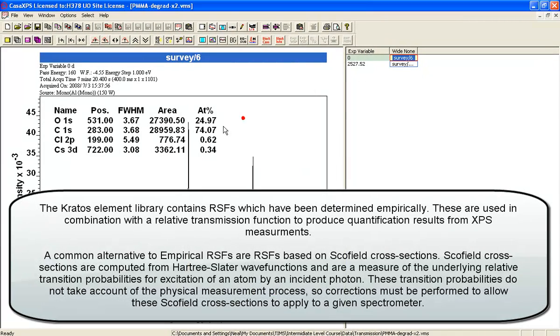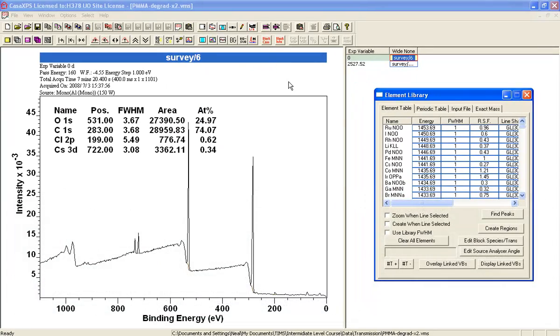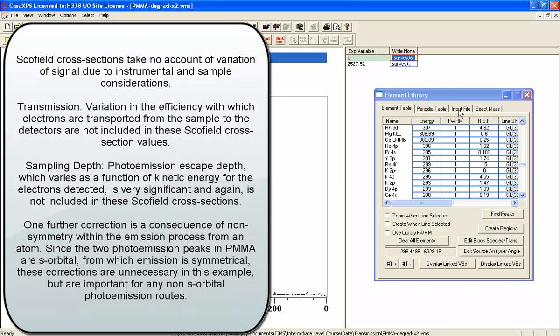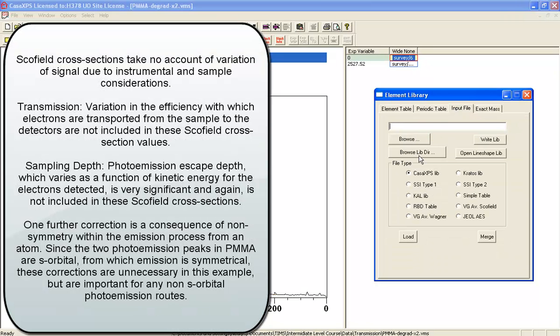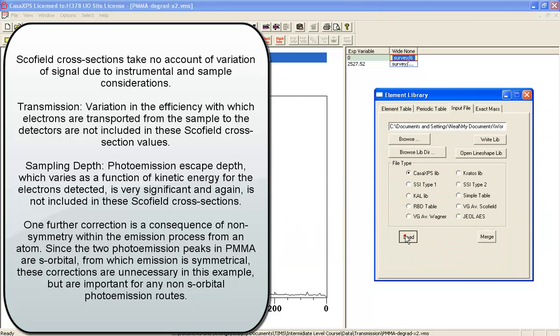We'll now investigate the quantification further by changing the strategy. What we'll do is alter from the original Kratos library to a library based on Schofield. I'm going to load the Schofield library here and press the load button so the table is updated.